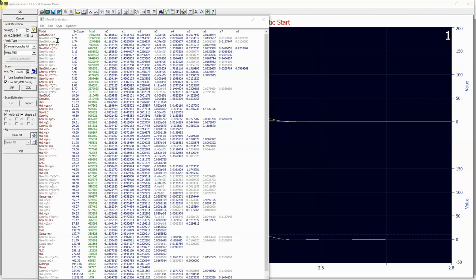For this example, the presumption of an isocratic shape was made as a result of the gradient baseline not being as yet apparent. In this case, however, the presumed isocratic peak shape is not true. Some measure of gradient is impacting the peak shape. When this compression is present, the fourth moment parameter compacts the fourth moment or kurtosis, the power of decay changing from a power of 2, a Gaussian decay, to a power that is higher than 2. Here we see that power being 2.07, 2.08.